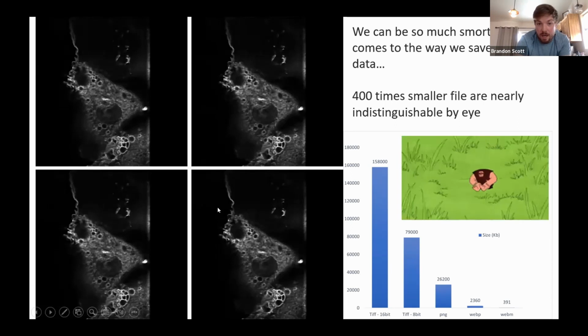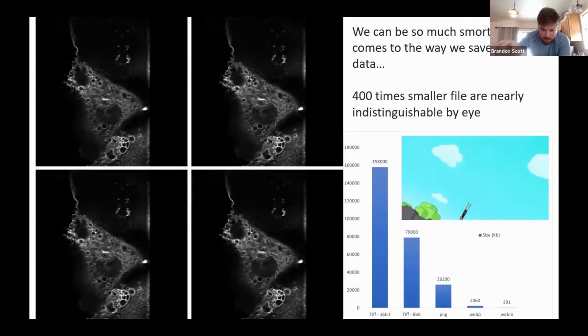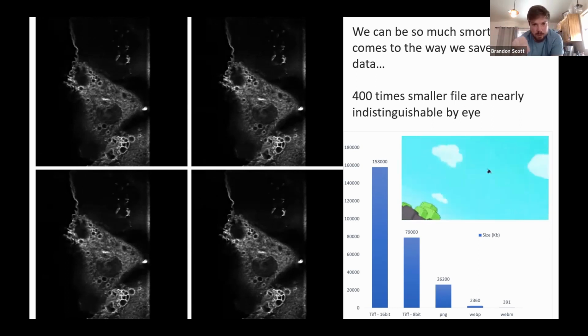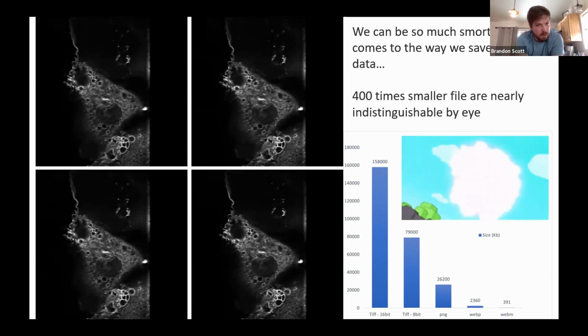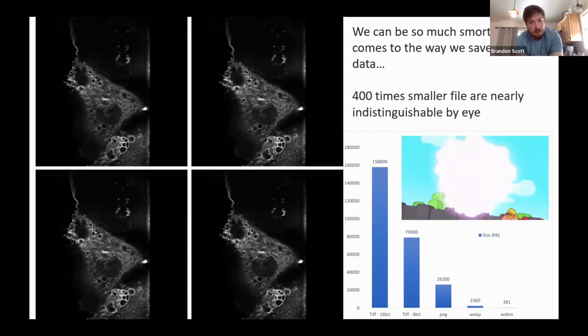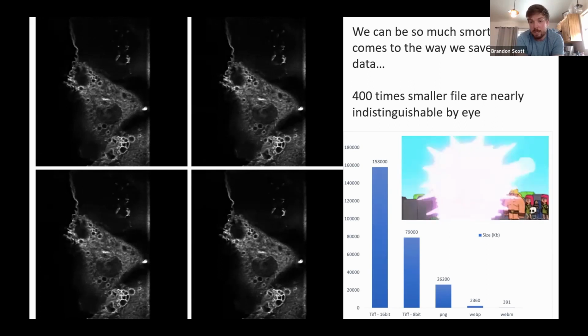And I think by eye, you could not do it. So these are not analysis things at this point, because they are lossy in their compression. You can tune it, but we can't do any more work with them in terms of trying to analyze the underlying data. But at this step, we're not trying to do that. We're trying to visualize these data in different ways.